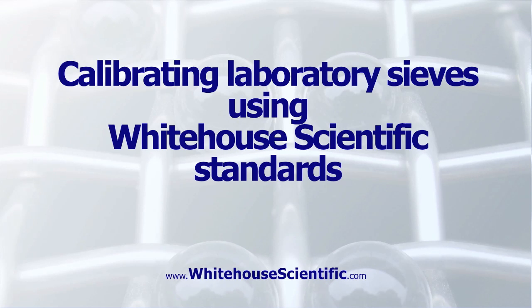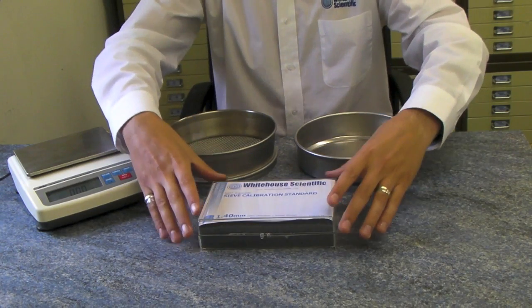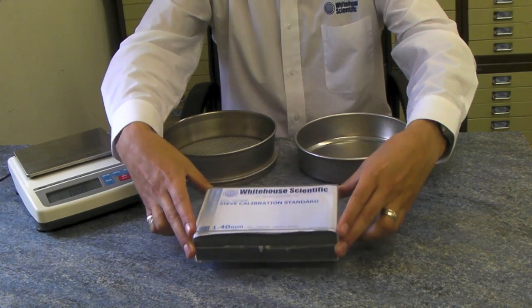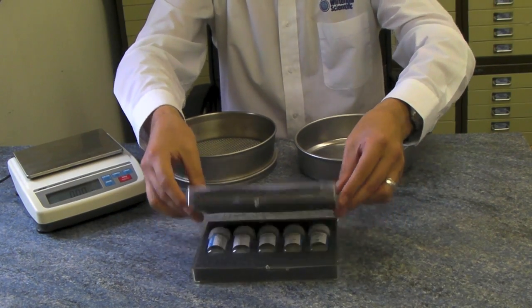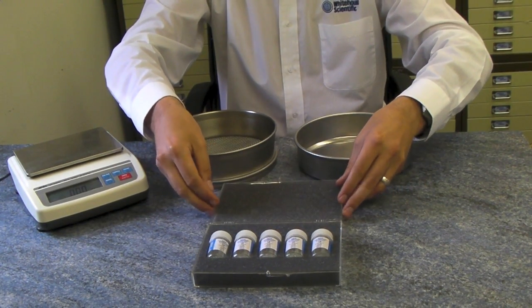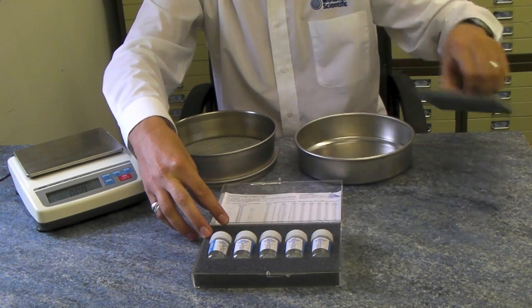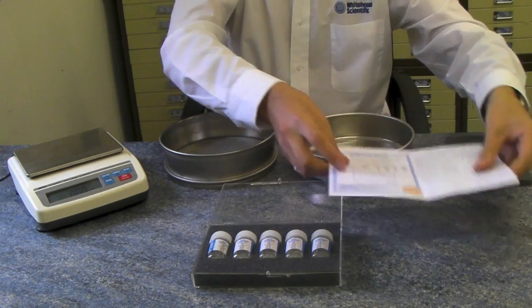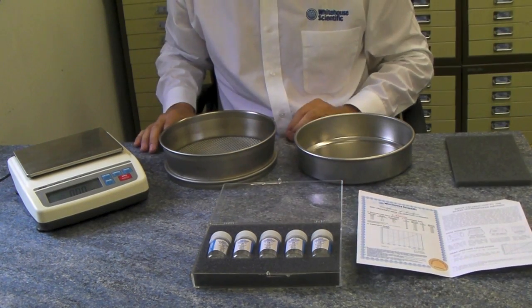Calibrating laboratory sieves using White House Scientific standards. Choose the calibration standard relevant to your sieve. White House Scientific have standards ranging in size from 20 microns to 3.35 mm. Each set of standards is provided with a detailed methodology, the certificate of analysis including a calibration curve and information regarding tolerances to ISO and ASTM recommendations.